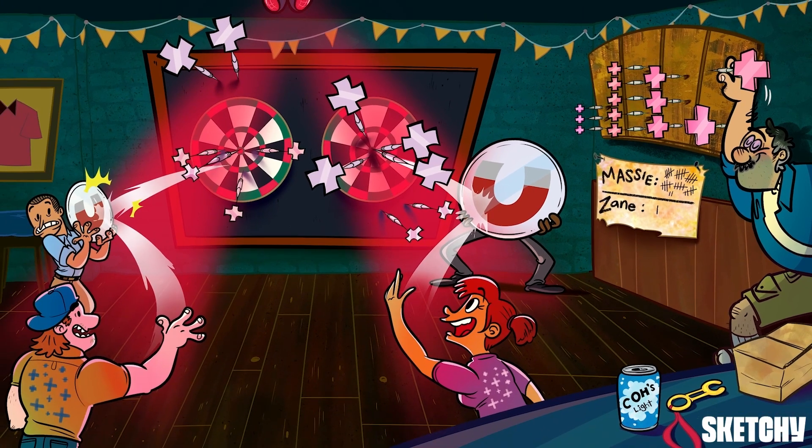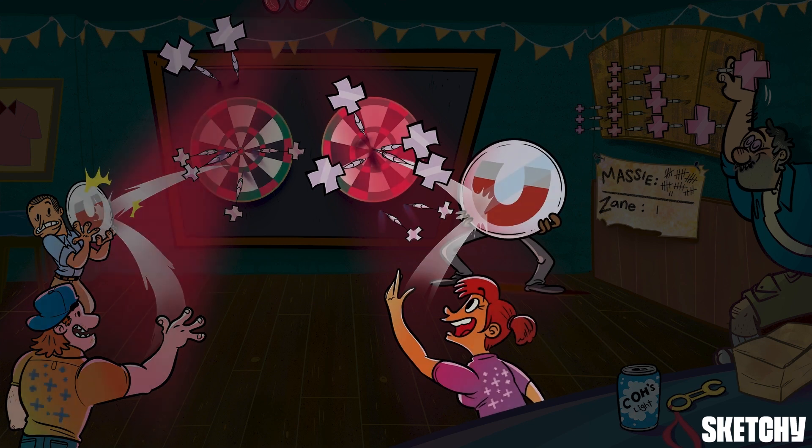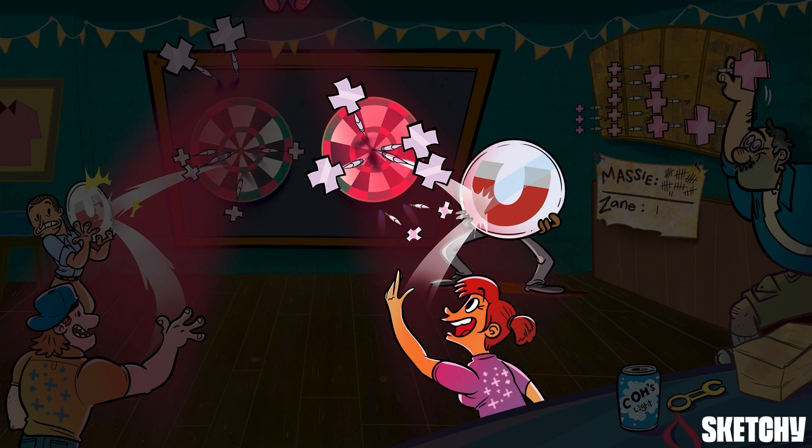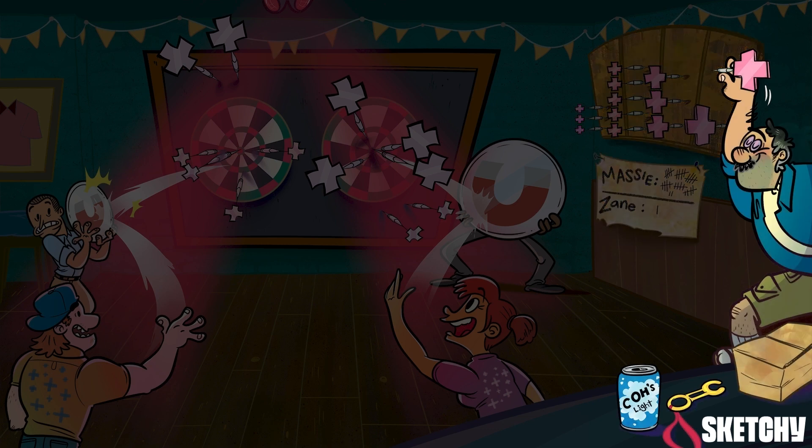Alright, when a dad in cargo shorts shows up, it can only mean one thing — he got his butt kicked in golf this morning, and he's looking to win back his fragile pride. So let's dart through a quick recap before he embarrasses Brad and Kerry. Mass spectrometry is a tool used to gain information about compound structure and mass. It works by breaking compounds into different sized cations. These cations pass through a magnetic field, which deflects them into a detector that measures their mass-to-charge ratio. It takes a stronger magnetic field to deflect heavier ions. The x-axis of a mass spectrum shows the mass-to-charge ratio of the deflected cations; when cations have a charge of plus 1, this equals their mass. The y-axis measures relative intensity, which tells you the relative quantity of cations of each mass. A mass spectrum can be used to gain information about functional groups in a compound, and the parent ion can be used to find the compound's overall mass.